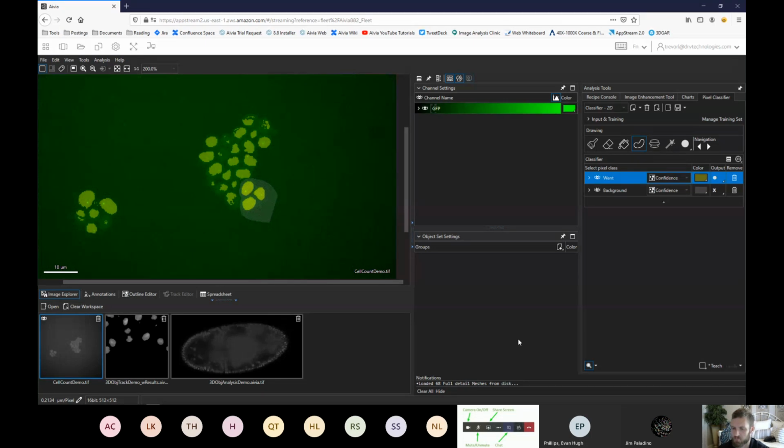I think in a tutorial format like this, explaining all these mouse movements makes this look a lot more difficult than it is. Once you play with this tool a little bit, you'll see that it's very easy to use, once you get the minutia of what to do specifically in the interface down. That's the whole point, to use machine learning to make our lives easier, right?